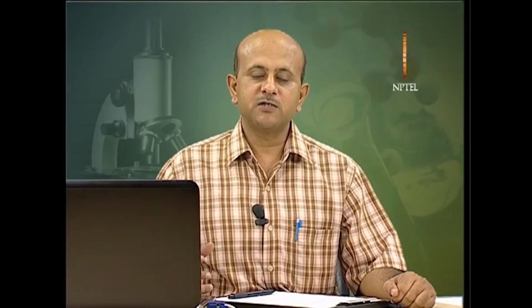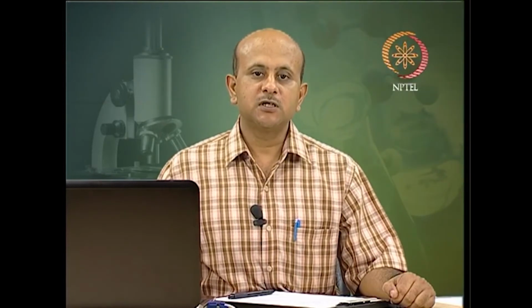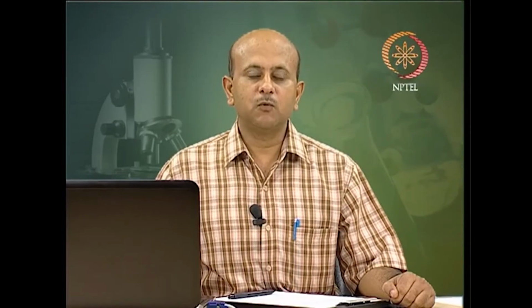So, now what is happening is that positive ions in solution migrate to the wall, and a double layer, as we have shown you, is developed at the wall of the capillary. Now, there is a Stern layer, which is a layer of positive charge that compensates for the negative charge on the surface, as I have shown you on the inner capillary wall, and there is a diffuse layer adjacent to the Stern layer, which is mobile, made of mobile cations.